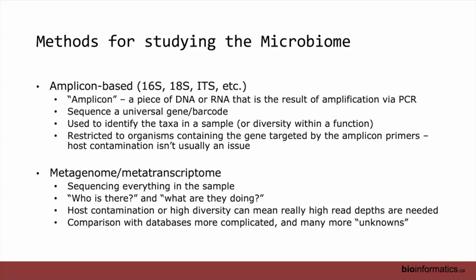But during the beginner workshop, we're going to be focusing on the Amplicon-based analyses. These are at least slightly more standardized in terms of the major steps that we're typically using for bioinformatics. There are a lot more options for metagenomics, and anyone staying will see those later on, I guess.